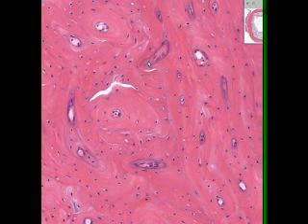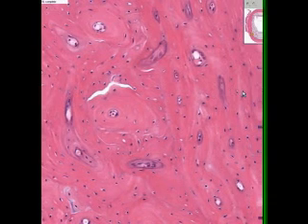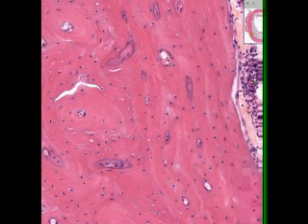So, to make a long story short, everything in the center of these concentric osteocytes are haversian canals. The Volkmann's canals, perhaps here, branch out at 90 degrees from the haversian canals. Here is the bone substance itself, hydroxyapatite, chiefly calcium phosphate. Here are the actual individual osteocytes. Here is the endosteum, which we see on this side, and we can see bone marrow here as well. And on the other side, we can see periosteum.